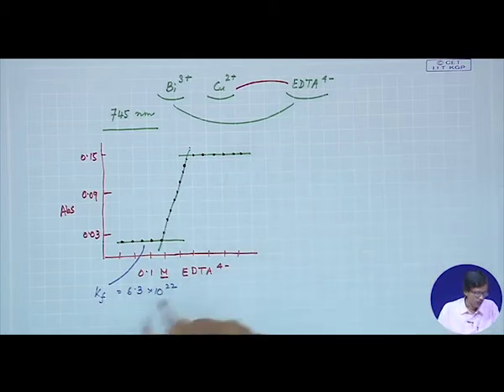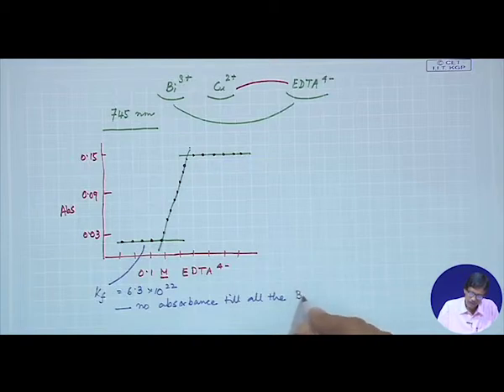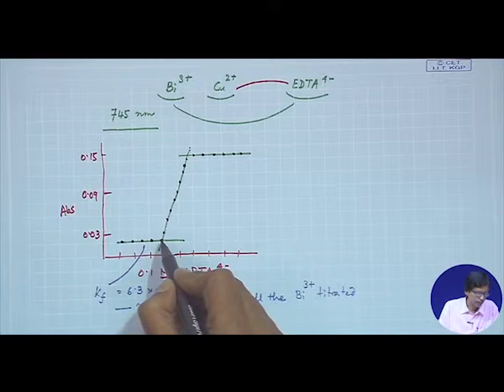So, we do not have any change in absorbance, no absorbance change, till all this bismuth 3 plus is consumed or titrated.